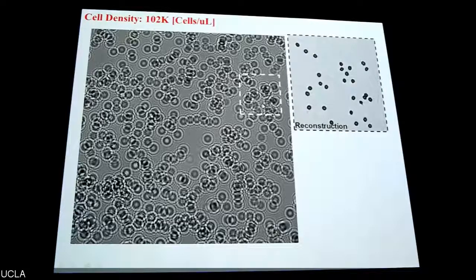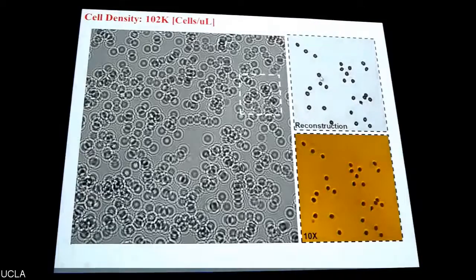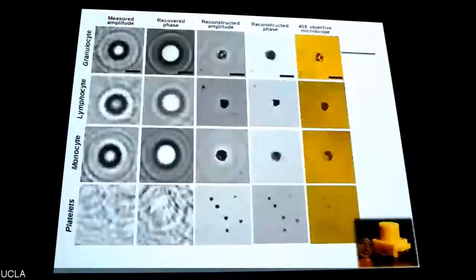So this is a very simple microscope, which works based on free-space optics and holography, to take these images that are holographic shadows of the specimen and quickly reconstruct real images of the samples, the red blood cells. Each one of these cells is about 7-8 microns in diameter, giving you exactly the same thing that a traditional light microscope gives, except without the objective lens.